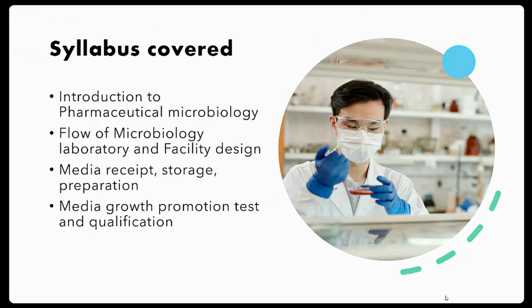After preparation of the media, we'll sterilize the media and we have to qualify the media before usage. What is the media growth promotion test? It is a quality test to check whether the media promotes growth or not. We will inoculate a known number of microorganisms and check the recovery. Each and every prepared lot should undergo a growth promotion test.